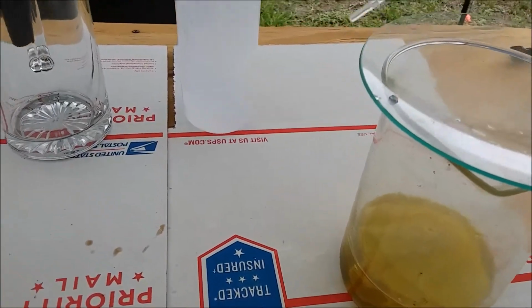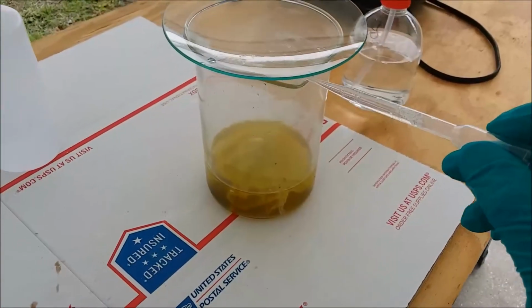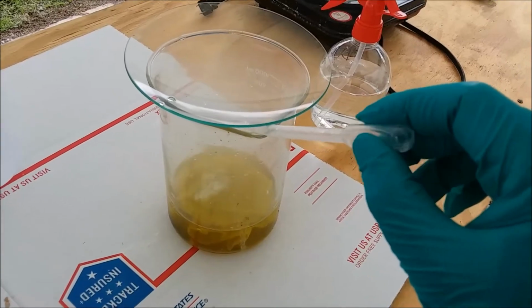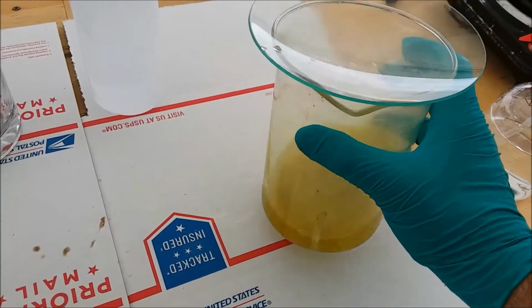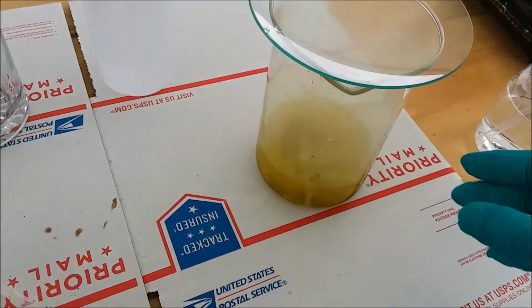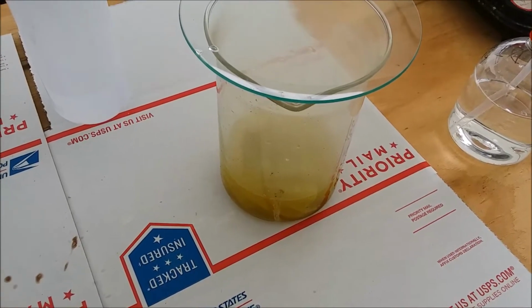I have a few milliliters of concentrated sulfuric acid drain opener here. I'm going to add that so that if there's any lead in here, that will precipitate out. Swirl it around and give it a chance. So if there's any lead in there, it will precipitate out, and then I'm going to get set up to filter this. Be right back.